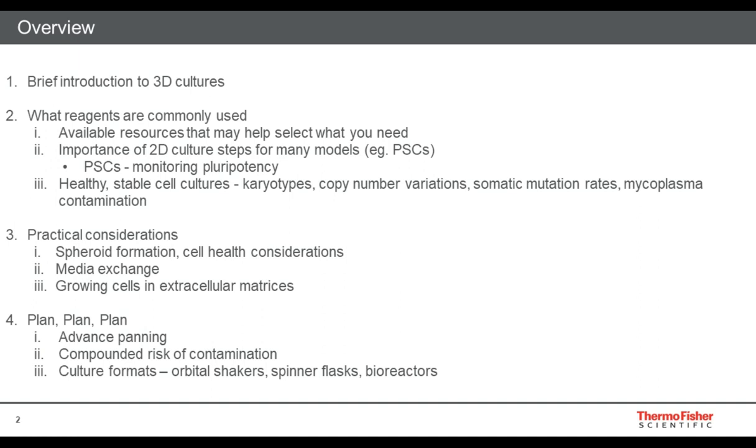After that, I'm going to talk a little bit about a couple of common techniques, but perhaps it should be uncommon techniques. Just some information about some differences that you will very quickly run into, some of which are probably self-evident. But regardless, if your background has been primarily or only working with traditional 2D monolayer cultures, there are some not subtle things that you will run into quickly that may present challenges to newcomers to 3D cell models.